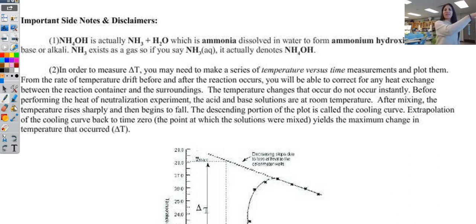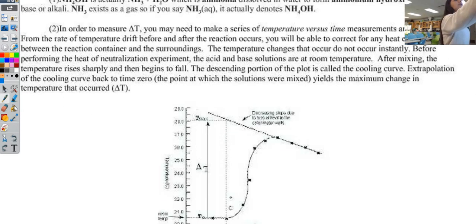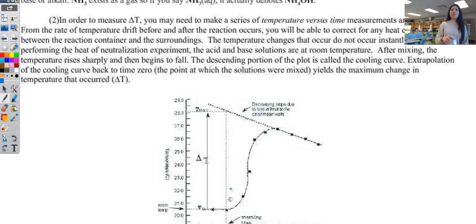So this is a part that I'm excluding or just using as a disclaimer in this lab, where normally if you were in class, we would use this part. So when you use the calorimeter, you first want to make sure that you start off with one of the reactants coming to a constant value inside of your calorimeter.